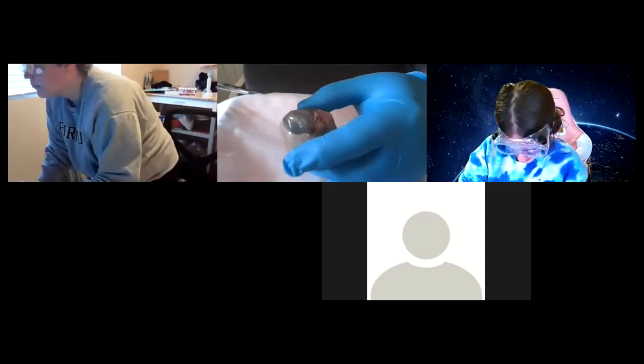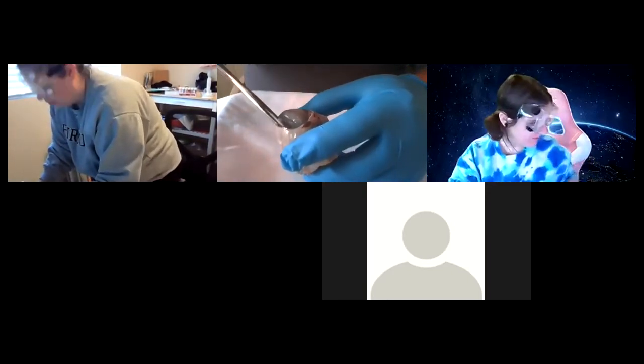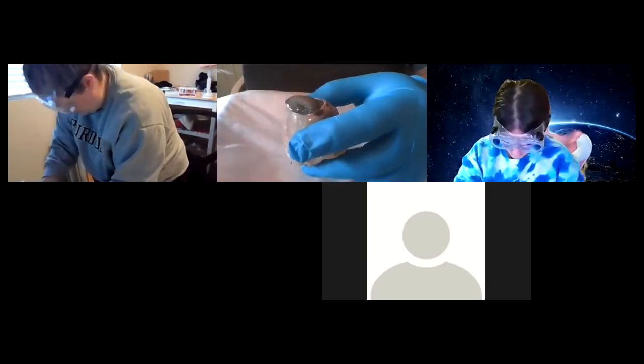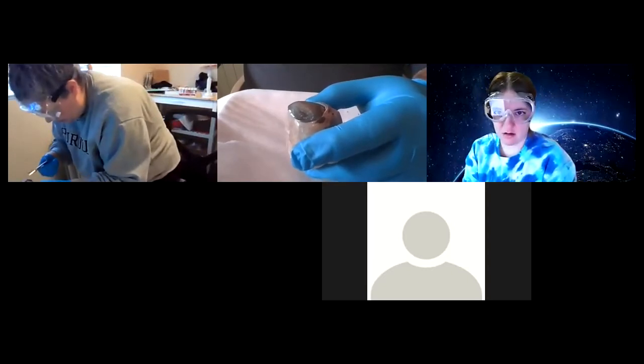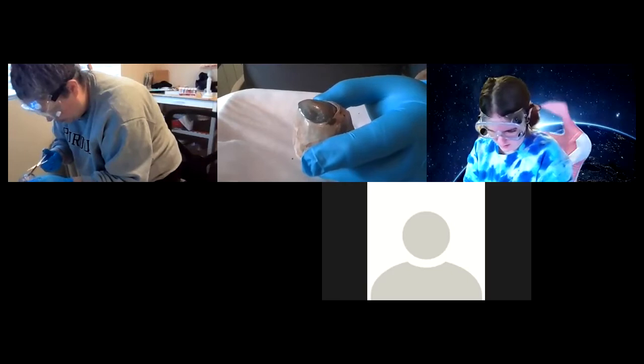Don't squeeze the eyeball — don't squeeze it. Right next to the cornea, poke in there and cut around it as best you can. Even though the cornea is kind of not totally round, it's kind of oblong, but it straightens out once you cut it.